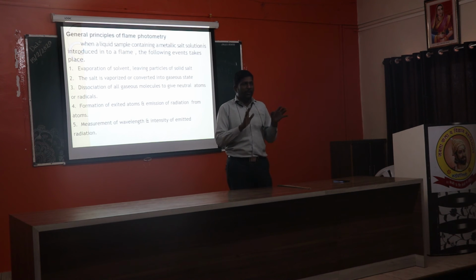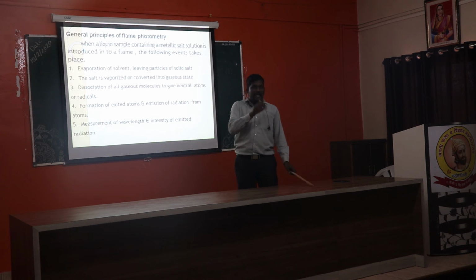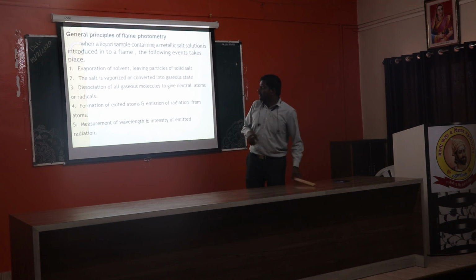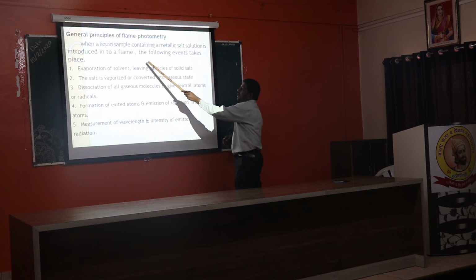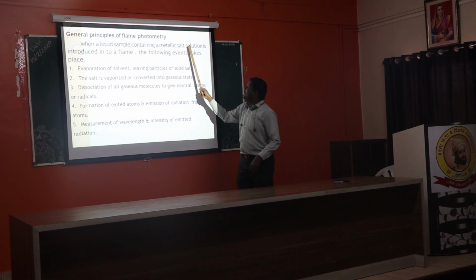Second point, the nebulization process takes place. The sample comes into the burner head above, and there is burning of that gas as well as that sample.